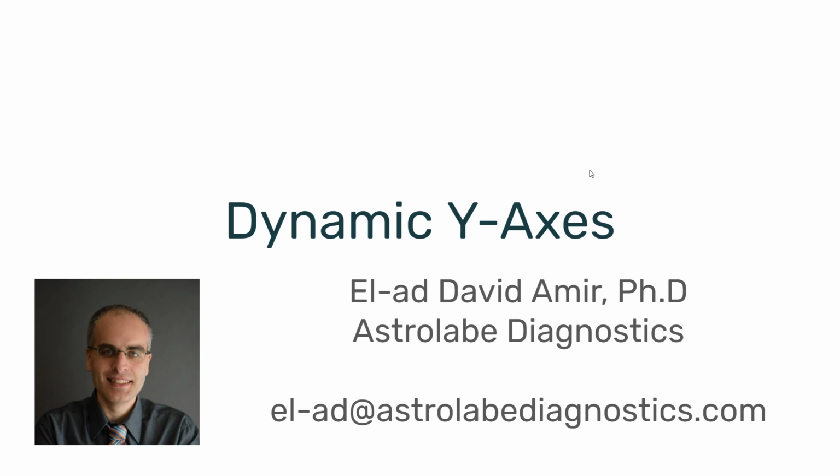Our goal here in Astrolabe is to help you analyze the data in as friendly a fashion as possible.